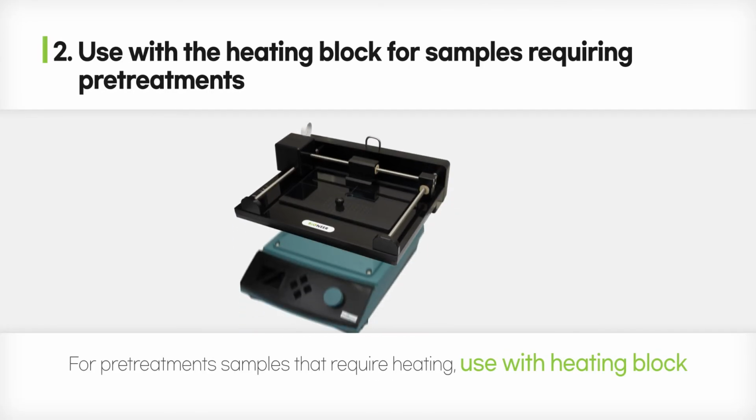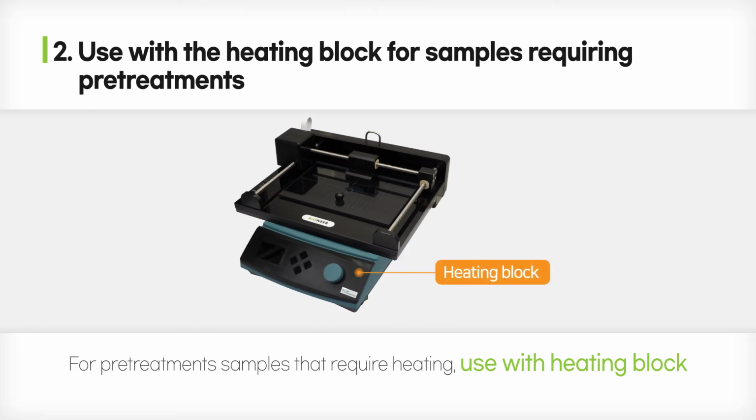If necessary, use with a heating block. For samples that need pretreatment, AccuLoader can be used with a heating block.